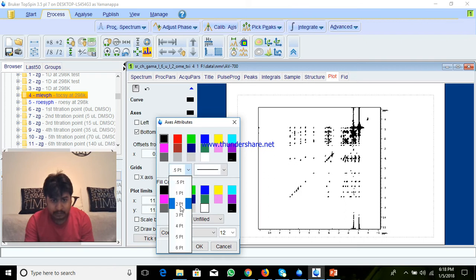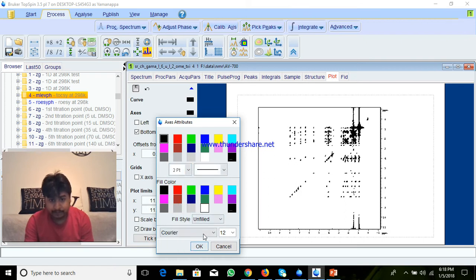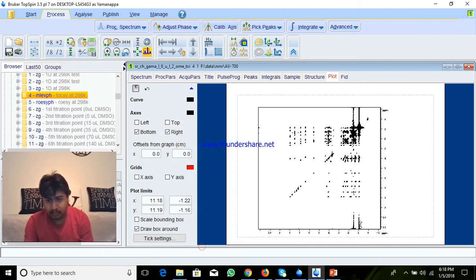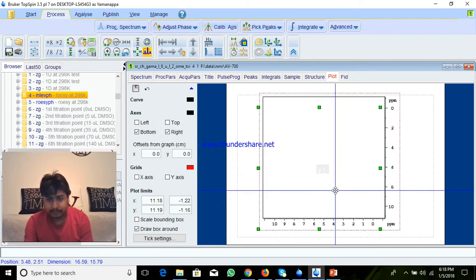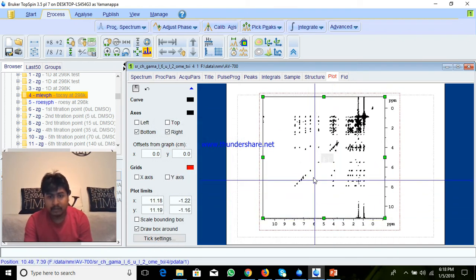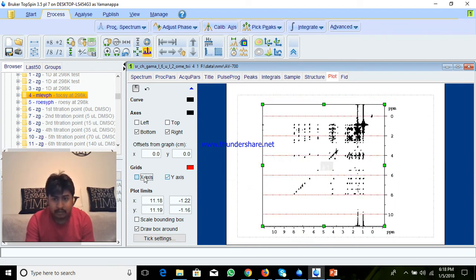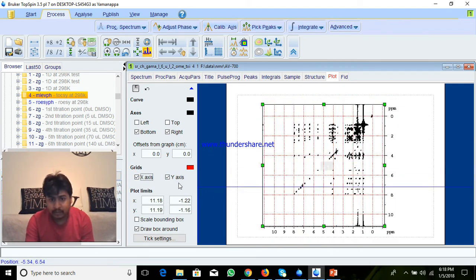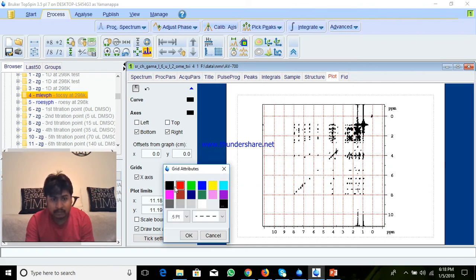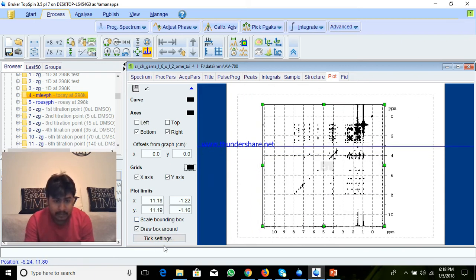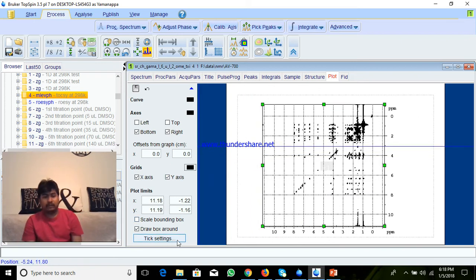You can change the grid to different colors also. After that, many other options are here. Because TopSpin is high resolution — only 800 dpi — if your display resolution is less than 800, you will not see this option. For that, only one option is: you have to hide this toolbar — right-click, Hide Toolbar. And if you give Shift+Escape, you will get it again.